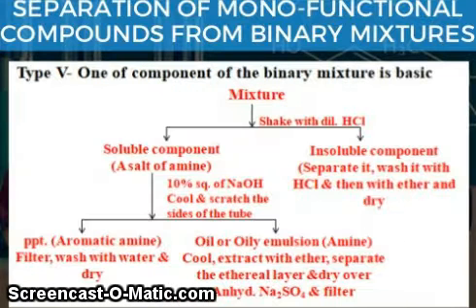Now if one component of the binary mixture is basic, shake the mixture with dilute HCl; separate the soluble component and the insoluble component, and then the soluble component you can recover.